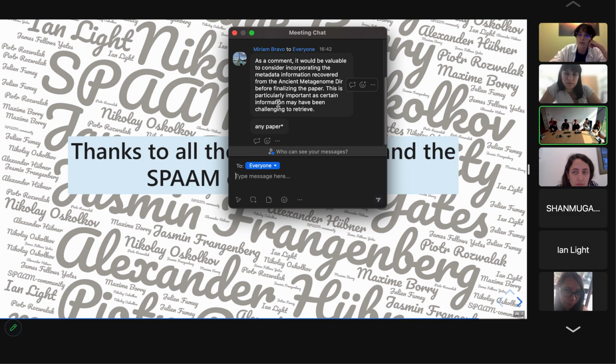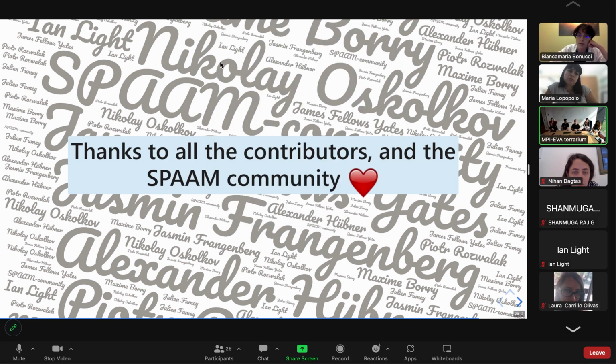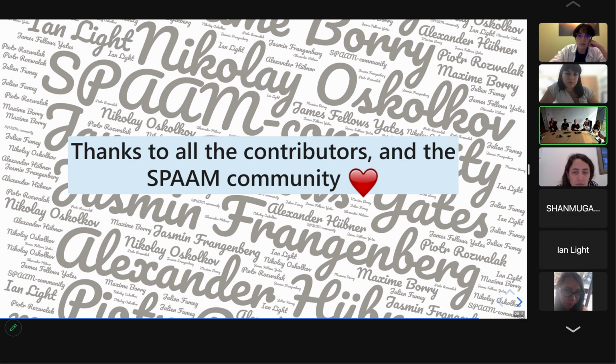So, like I said before, if you use the AncientMetagenomeDir tables as the template for your papers, then that information will be there for you later on. And if there is any other critical information you think is missing from AncientMetagenomeDir that should be added, you can also propose that, and we can go back and update it.